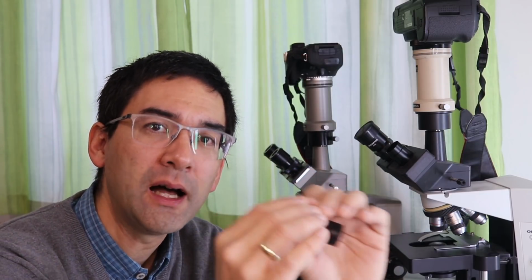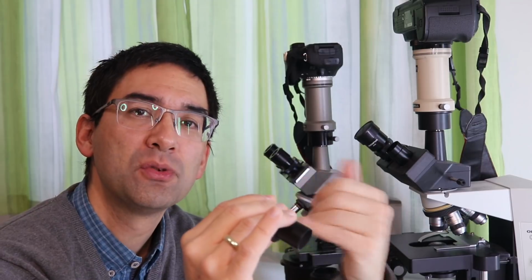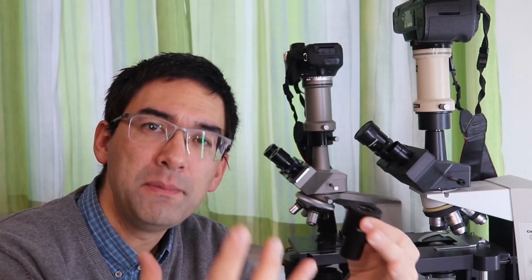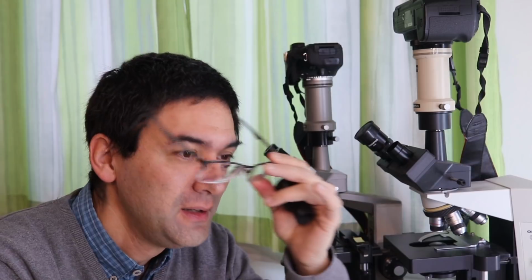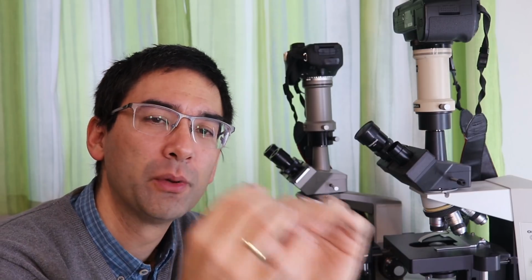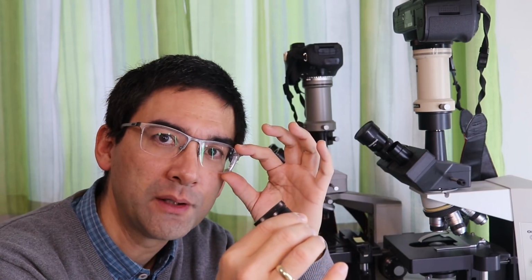So for a long eye relief eyepiece, you have to be further away from the eyepiece to see an image. And for those eyepieces that have a short eye relief, you're almost sticking your eyes directly into the lens, so the distance has to be very small. Now, eyepieces with a long eye relief are really good if you wear eyeglasses, like I am doing right now, okay?